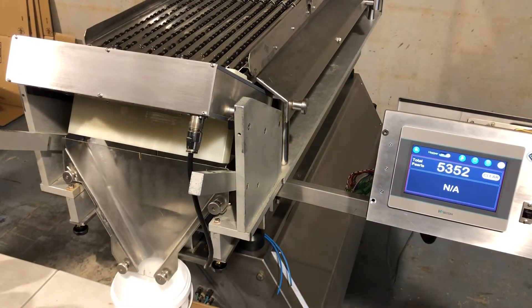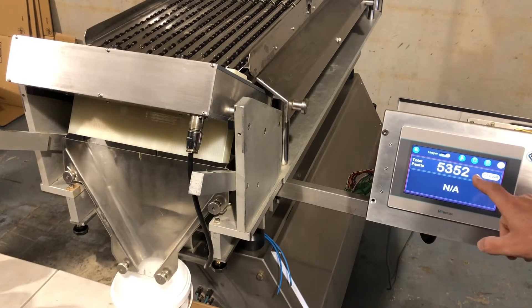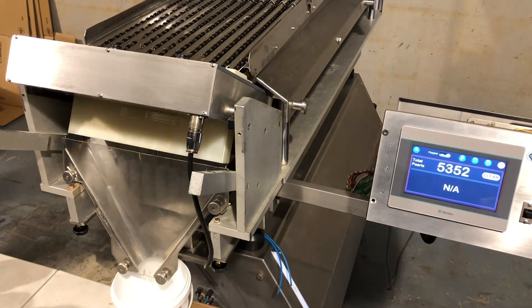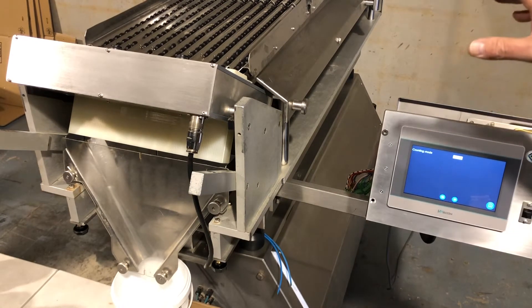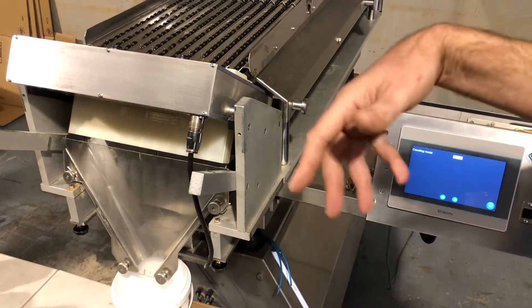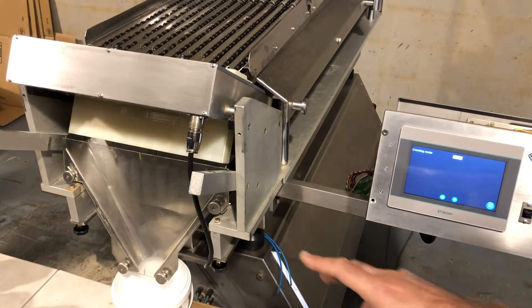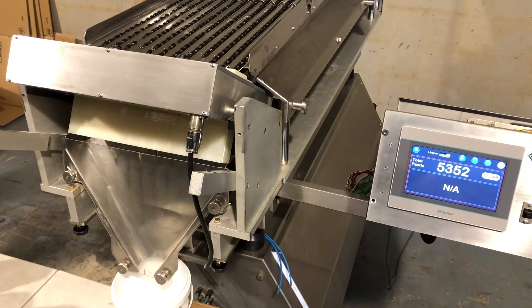So we've loaded some product now. This is your total number of pearls. In counting mode zero, which I'm going to show you first — counting mode zero, which you can set here in the settings — just means that whatever pearls come off the vibratory plates, it will count them in the bucket. If your bucket is full, you would have to stop the machine, change your bucket, start it again and it will just go on like that.